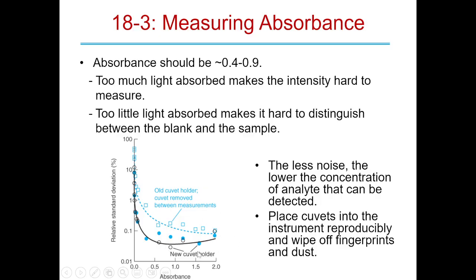Okay. As you get up past 1.5, remember how I told you that was your cutoff? Don't use anything past 1.5 on the visible light spectrometer. You start getting major increase too, okay? And this will actually start going up and up and up.